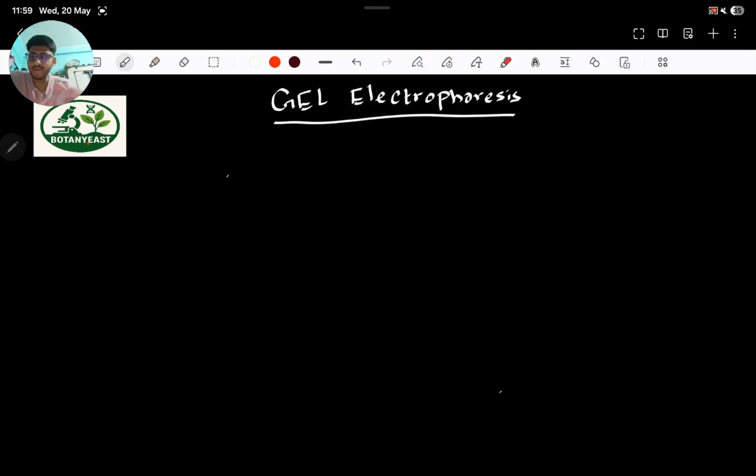Hello everyone, welcome back. Today we are going to understand gel electrophoresis, one of the most important topics of biotechnology, also for your NEET examination. Okay. So by the end of the video, you will understand what gel electrophoresis is, its principle, the steps involved, and some important NEET questions. Okay, so let's begin. First of all, what is gel electrophoresis?